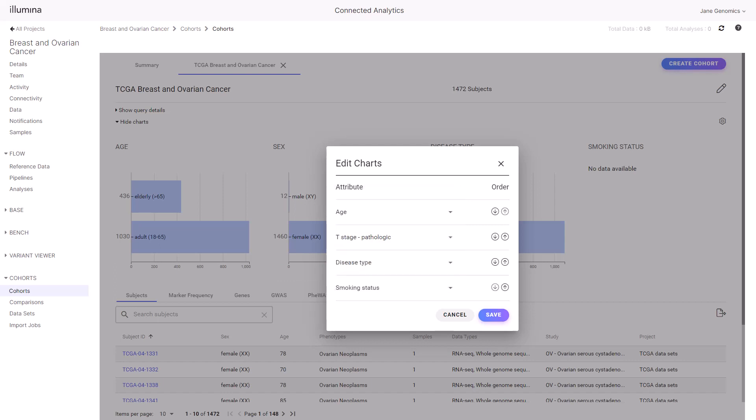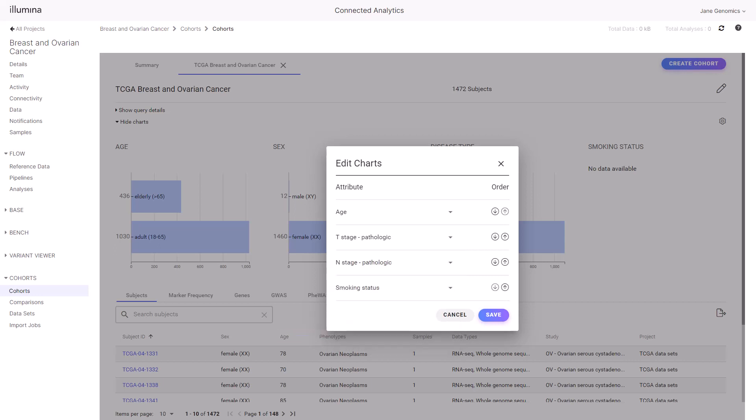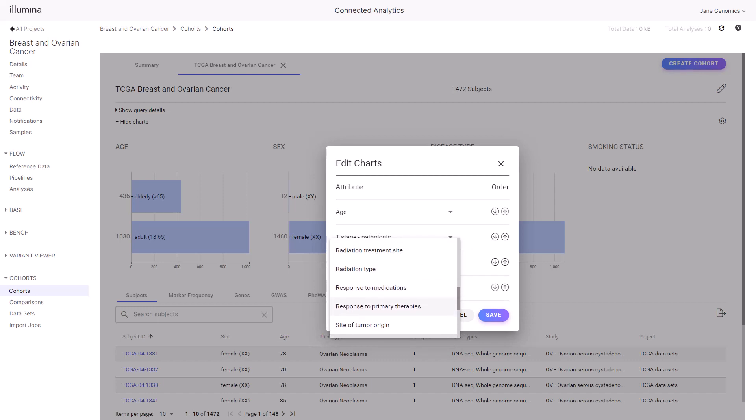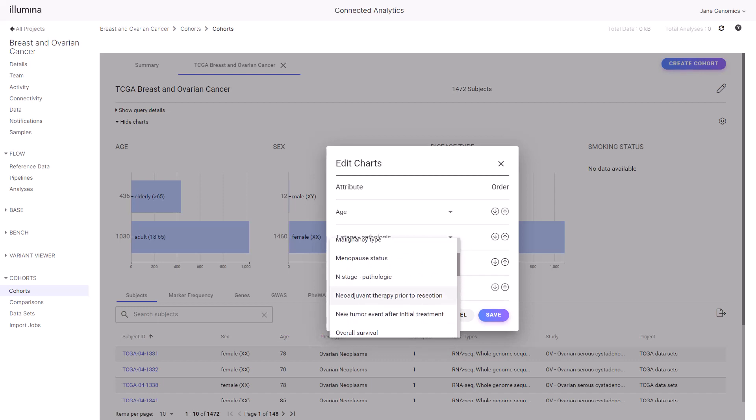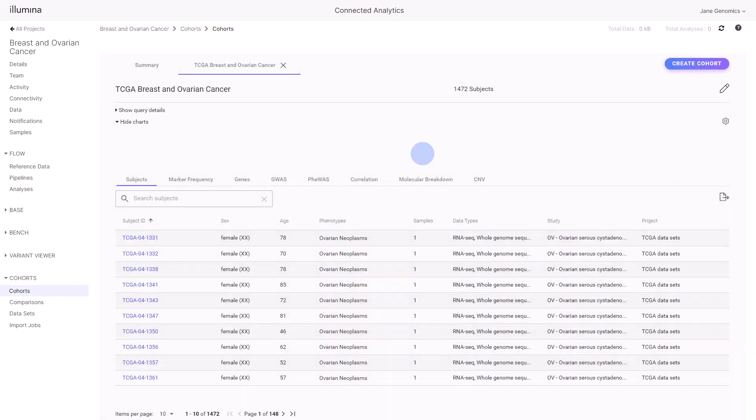N-stage pathologic describes whether the cancer has spread to nearby lymph nodes. M-stage pathologic tells whether the cancer has spread, metastasized, to distant parts of the body. Select Save to update the chart's attributes.